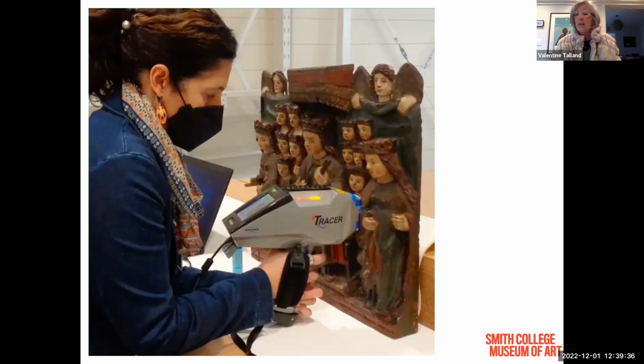And there are other techniques that we use in conservation, lots of them, in fact. Many of them are non-destructive. Using the microscope is a really good way to study an object. I've already illustrated close examination and the use of ultraviolet light. And then there are other techniques that we use that do require taking a sample, and if there's time at the end, I'm happy to talk about those. Next slide, please.